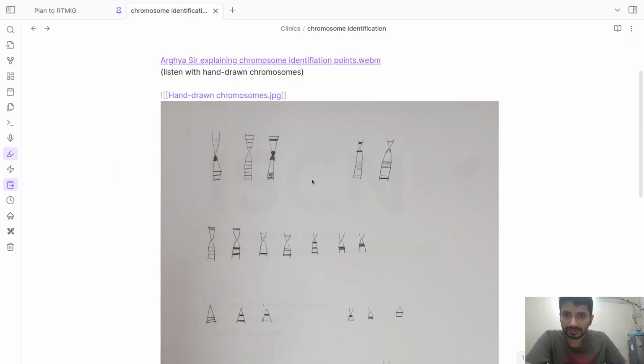So let's start with chromosome 1. So chromosome 1 is a metacentric chromosome with a dark band on the Q arm and a disappearingly light part on the P arm of this chromosome. This central dark triangular band on the Q arm is actually the characteristic, along with this very light distal part of the P arm. That is chromosome 1 for you.